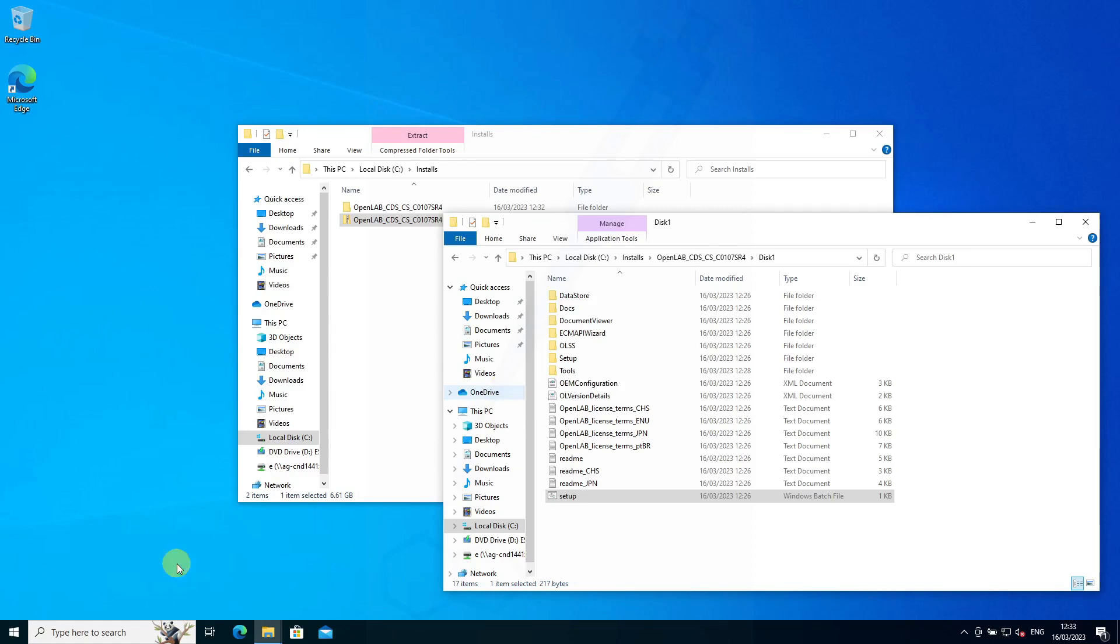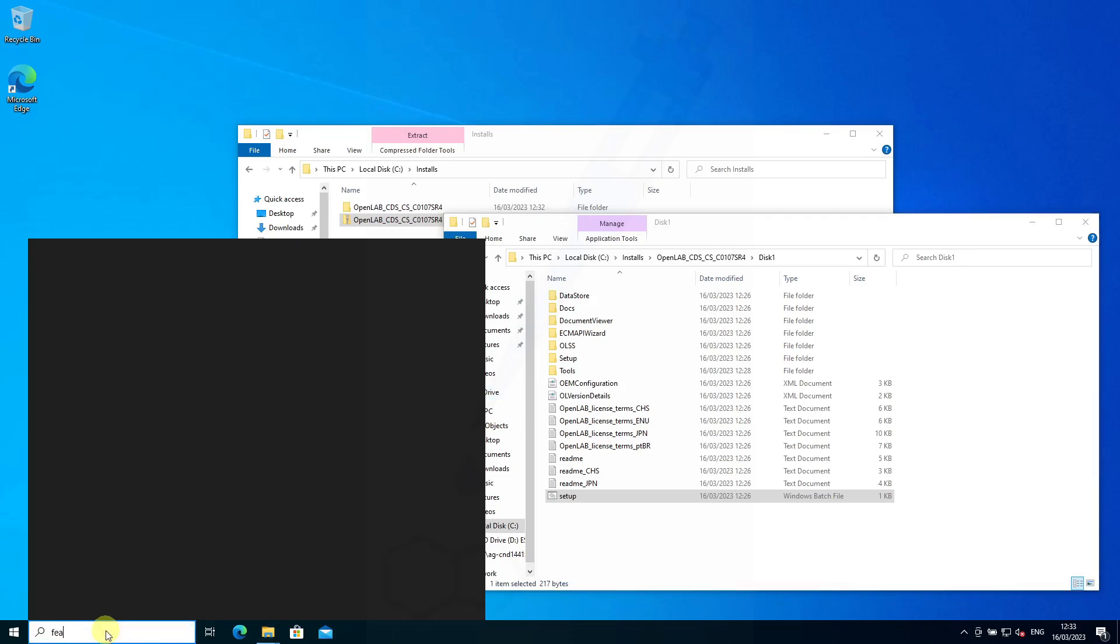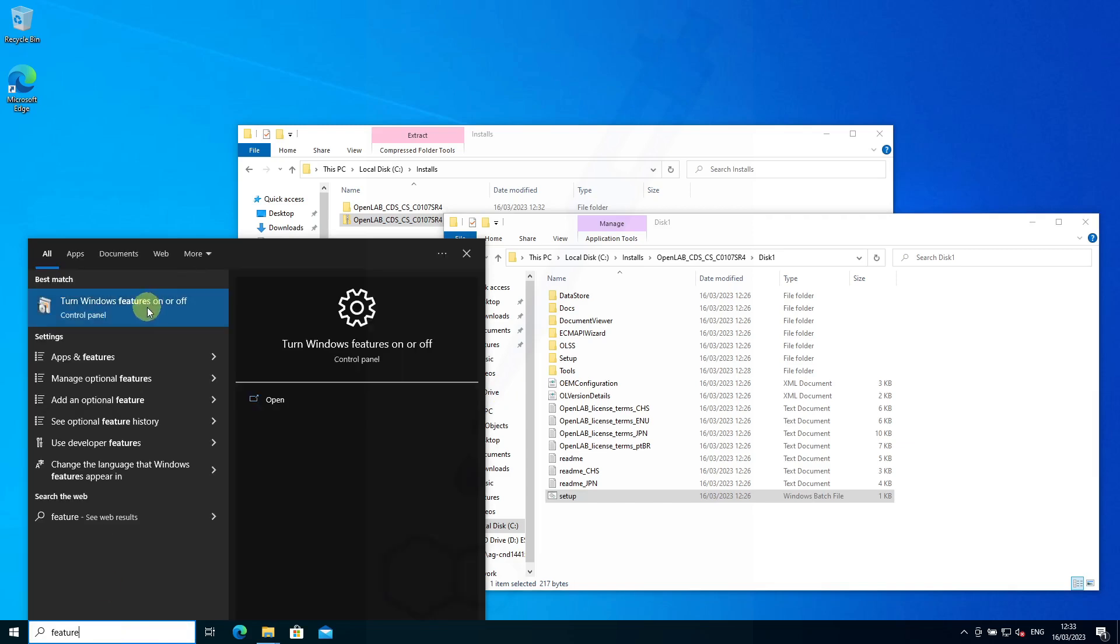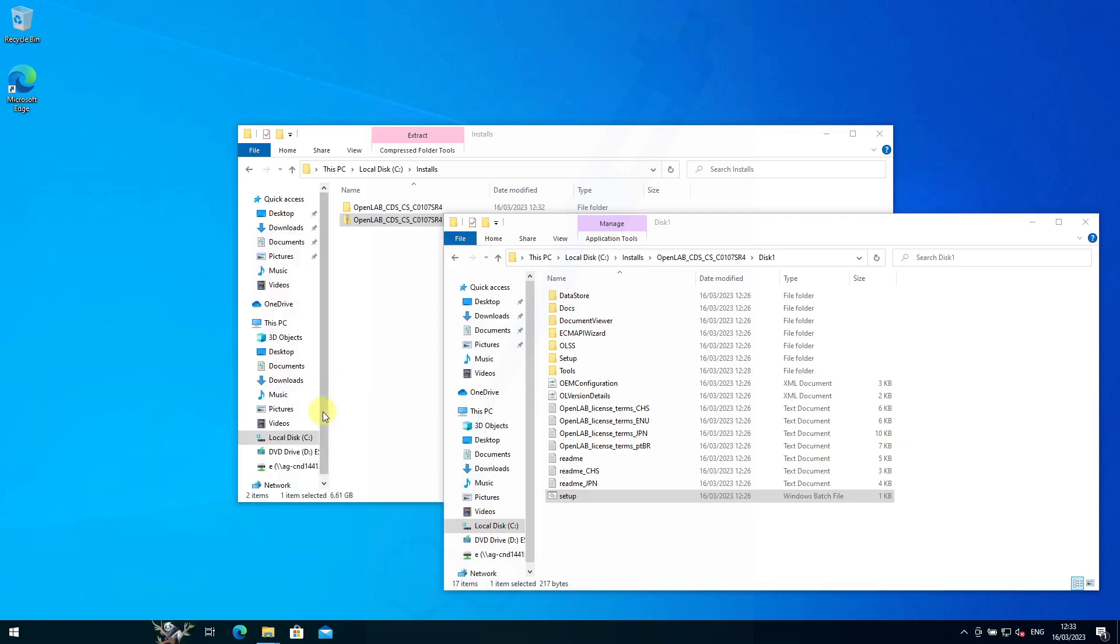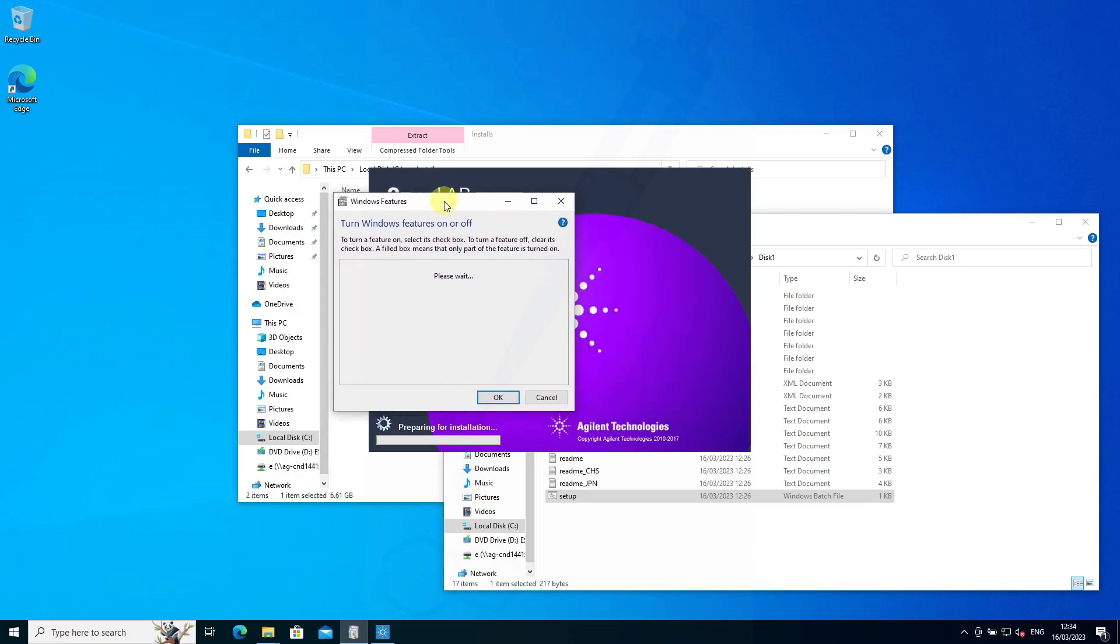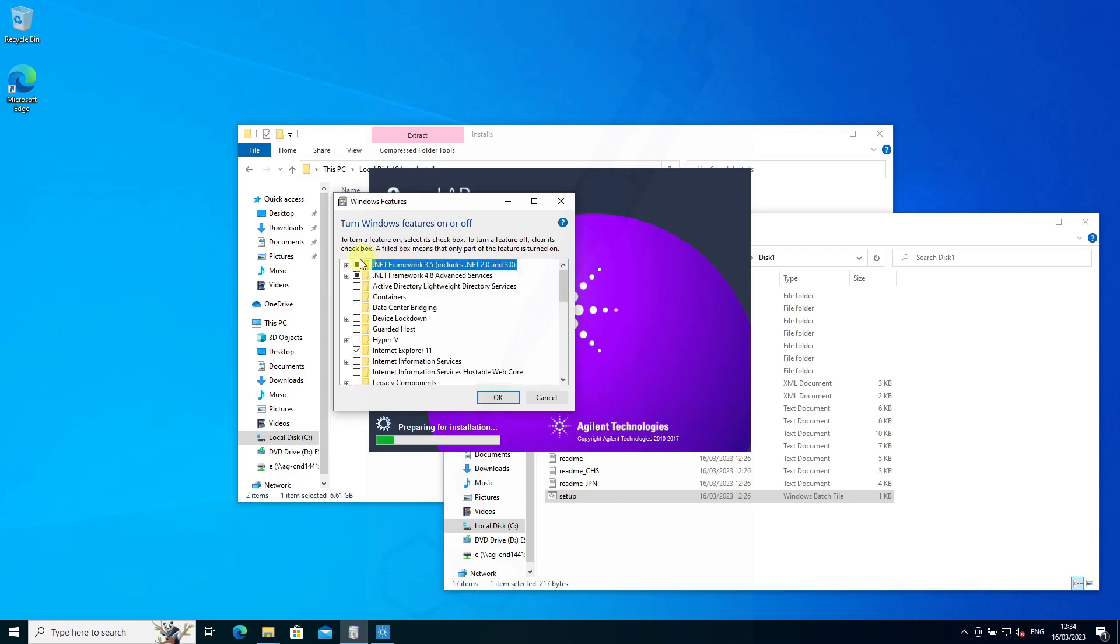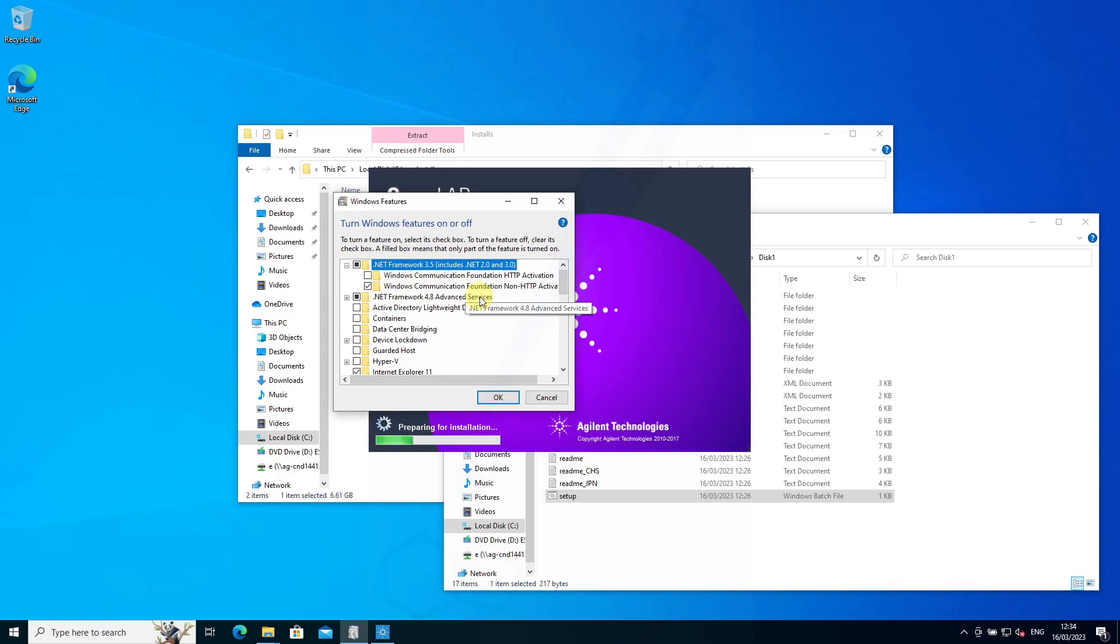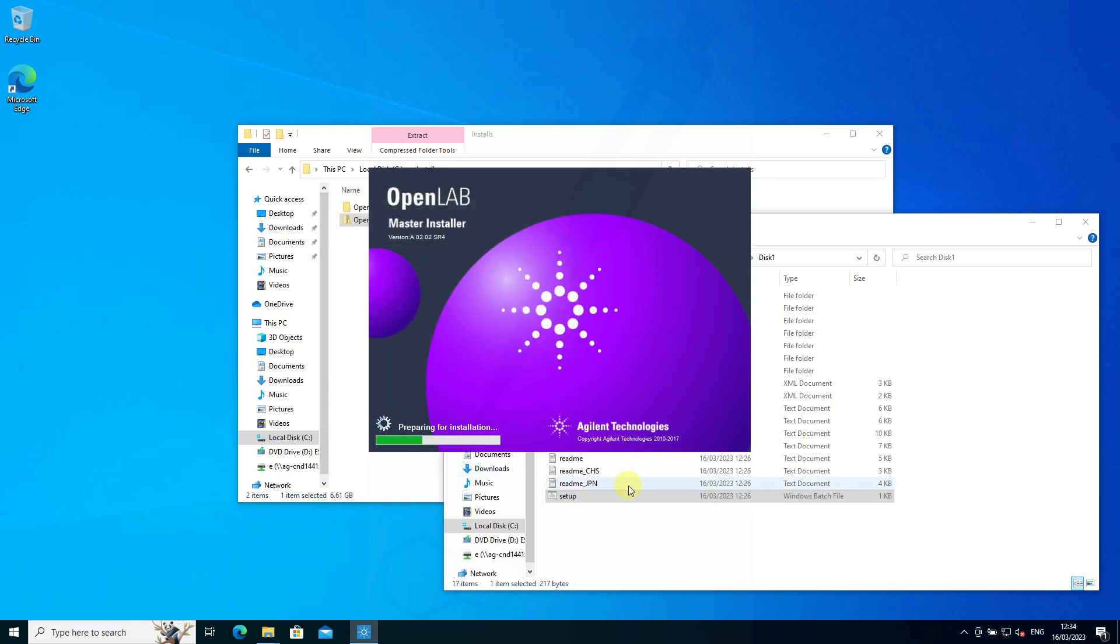.NET Framework 3 needs to be active. If you need to activate that feature, turn Windows features on and off, and you'll see that .NET Framework 3 needs to be turned on if you haven't done so already.